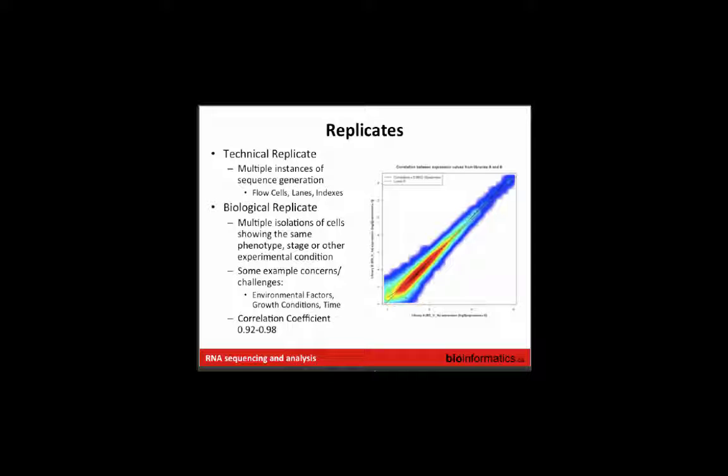What happens when you have the undesirable situation of comparing replicates across multiple platforms, but coming from the same sample stream, and you may have spike-ins? Maybe that's a more detailed question. Yeah, I mean it's interesting. I don't think that I've done Ion Torrent versus Illumina. I don't think that we've done much of that.